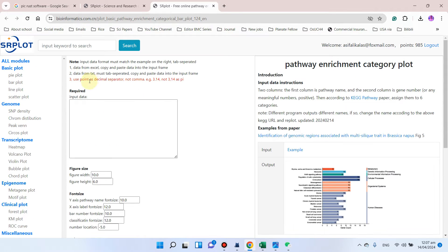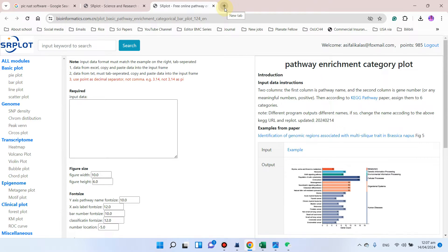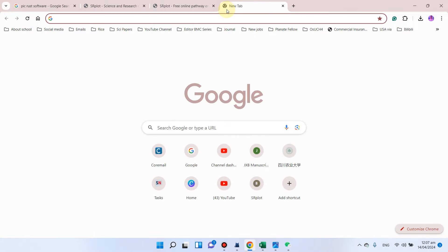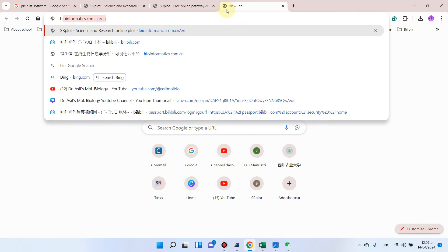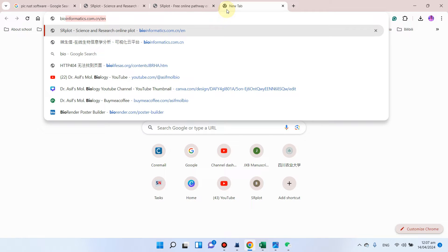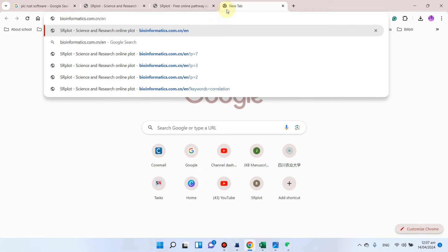Let me show you how you can access this pathway enrichment category plot. First of all, you can go to bioinformatics.com.cn slash en for English version.